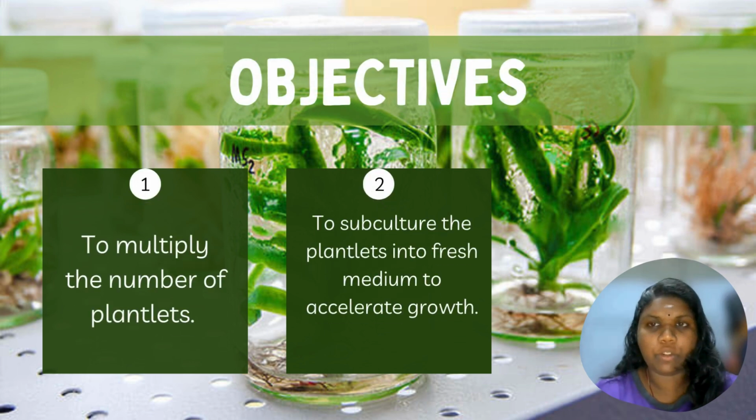The first objective is to multiply the number of plantlets. Our second objective is to subculture the plantlets into fresh medium to accelerate their growth. These objectives guided our experimental procedure throughout the project.